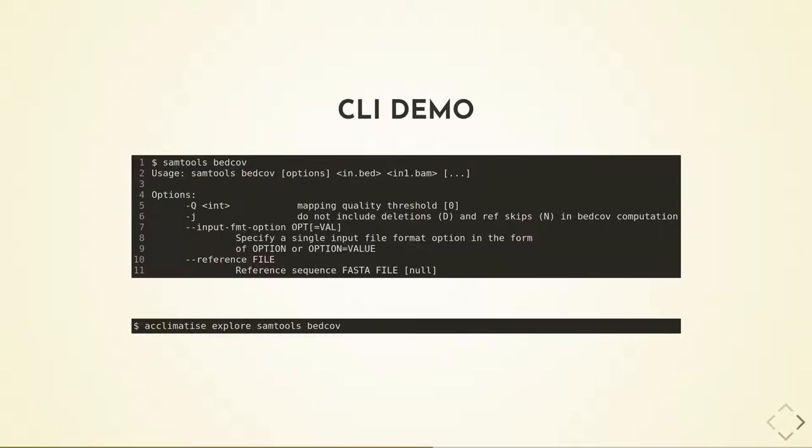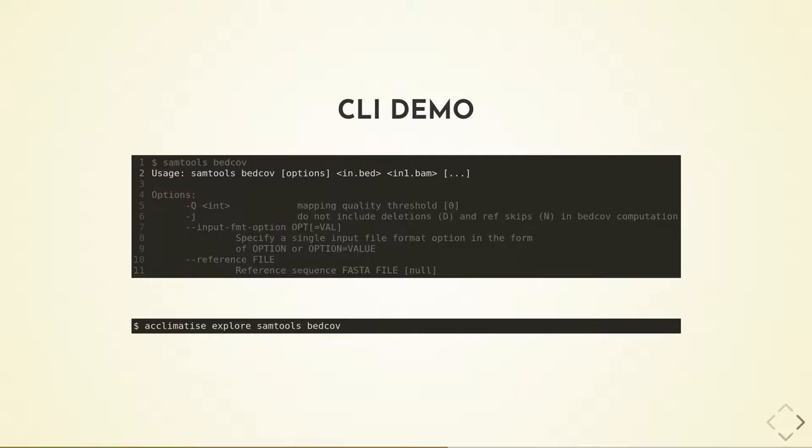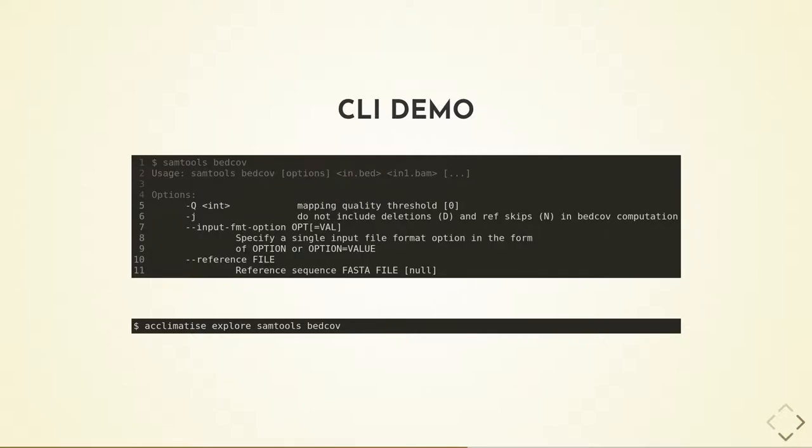To demonstrate how Acclimatise works, here is the help output from samtools bedcov, part of the samtools suite of utilities. As you can see, samtools bedcov has two mandatory positional arguments and four optional flags.